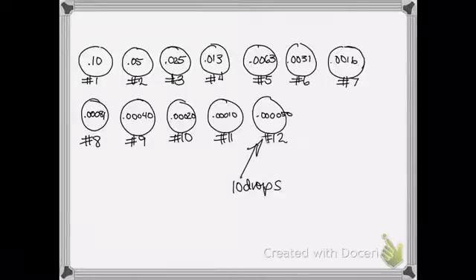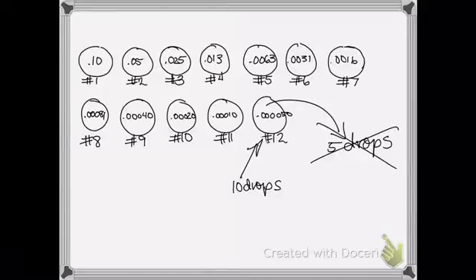So what they want you to do before you move on is they tell you to withdraw 5 drops from this last well plate and just discard it, just throw it away. You want to know why? Because each of these wells is going to have a remainder of 5 drops. Okay, so each one of these wells now has 5 drops inside.